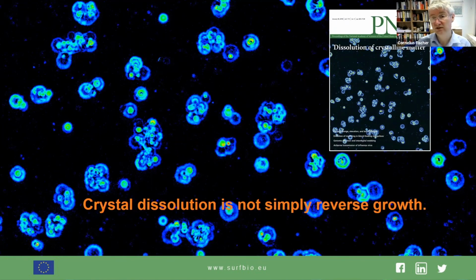So it's not just about applied stuff that you can analyze what's going on with the material under investigation: dissolution, growth, sorption of nanoparticles, sorption of colloidal materials, aggregation of particles, or formation of thin films that are composed of cells, of transparent organic material. These are all applications that you can track with this kind of technique, but because of the quantitative data sets, you can also tackle a lot of fundamental questions.